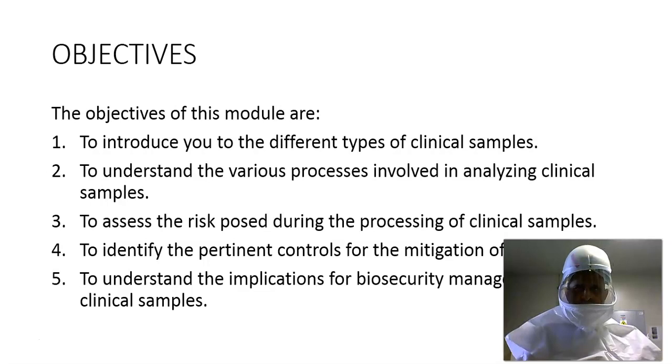The objectives of this module are to introduce you to the different types of clinical samples, to understand the various processes involved in analyzing clinical samples, to assess the risk posed during the processing of clinical samples, to identify pertinent controls for the mitigation of the risks, and to understand the implications for biosecurity management of clinical samples.